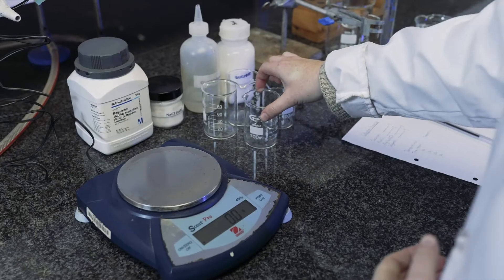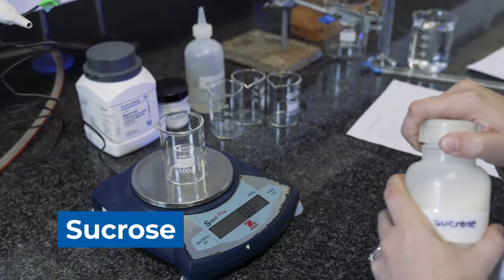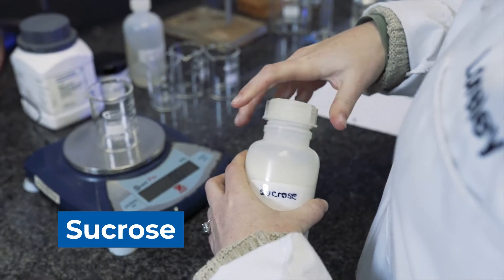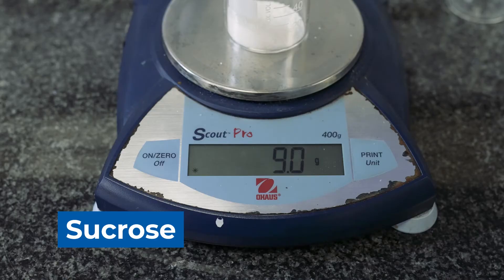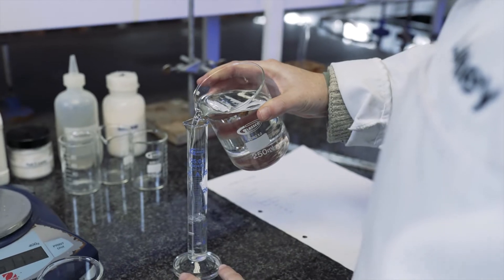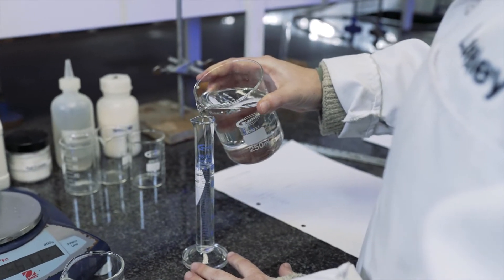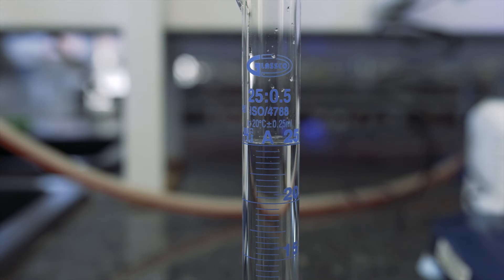We're going to start the experiment by weighing out sucrose. Now that we've weighed out the sucrose, we can add 25 milliliters of distilled water into our beaker of sucrose.